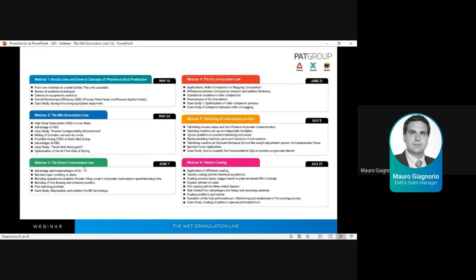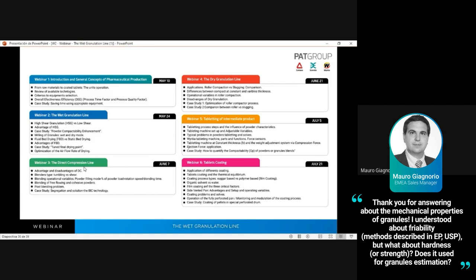Okay. Now, going back to the questions, we have another question from Elena, and she says, "Thank you very much for answering about the mechanical properties of granules. I understand about friability methods described in EP, USP, but what about hardness or strength? Is it used for granule estimations?" Arturo, please proceed with the answer to her question.